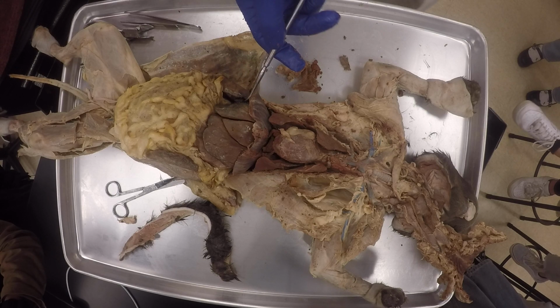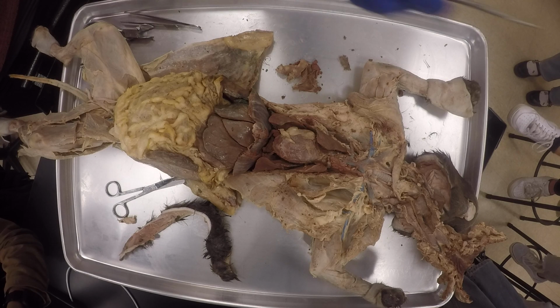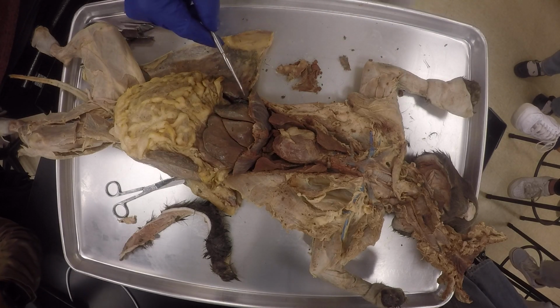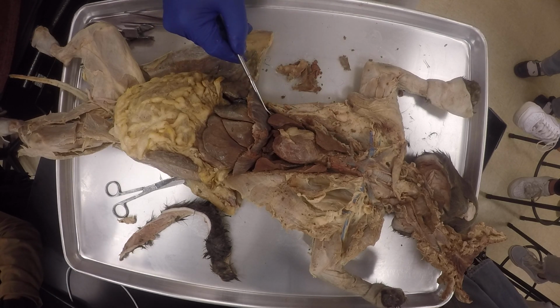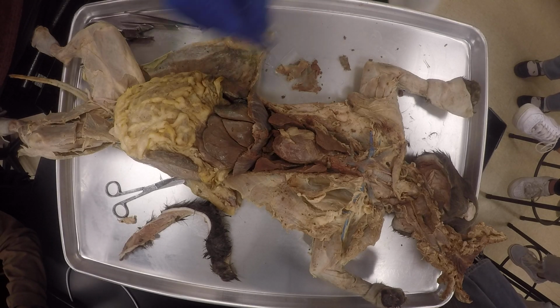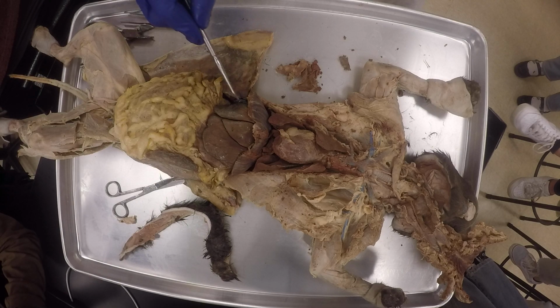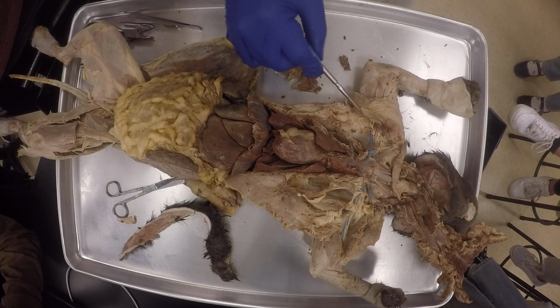And right where you see the gallbladder, the liver is more on the right, but it goes to the left a little bit. So all of these are right. If all these are right, the other one is going to be left. You don't even have to guess. The gallbladder will tell you which side is the right.